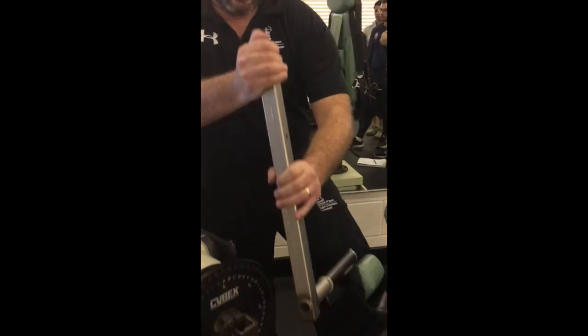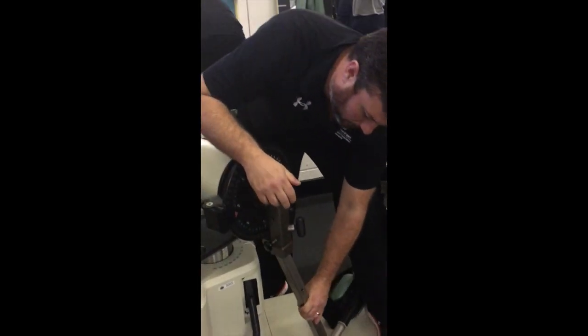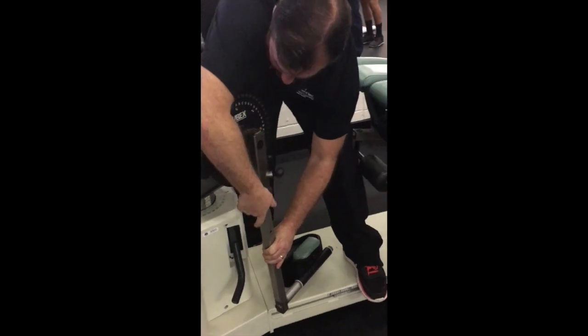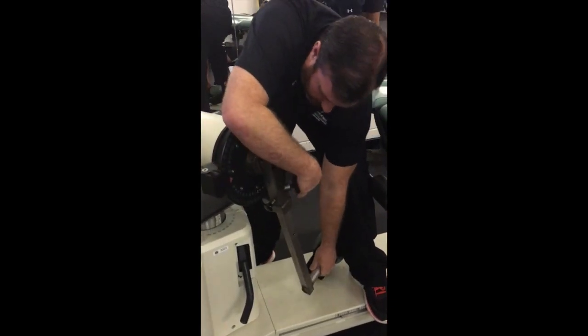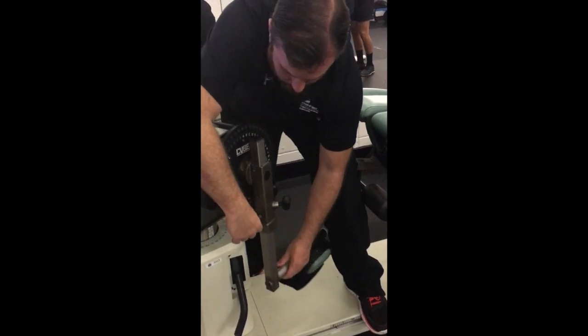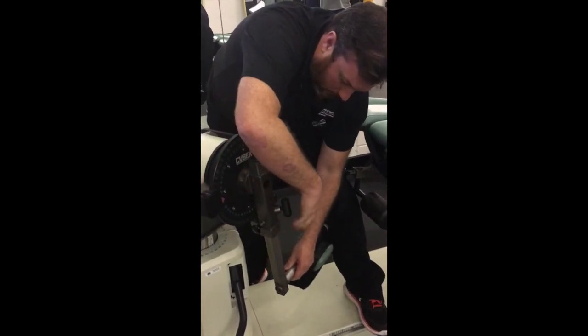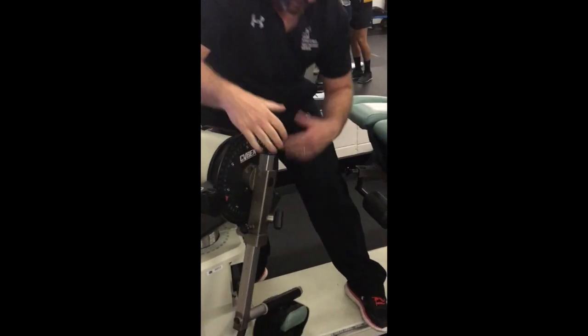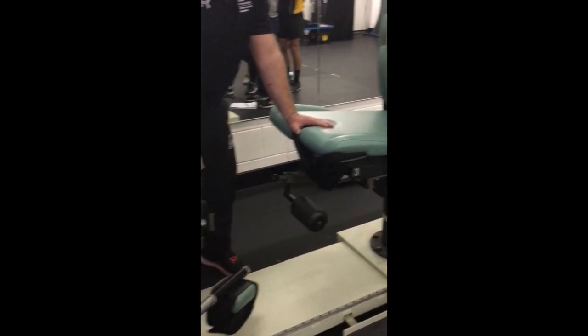Basically, then what happens is that one, amazing, when the guy's serviced it, he's tightened everything. Slots into there and then just tightens up. Okay, and we can faff around with that in a little bit.